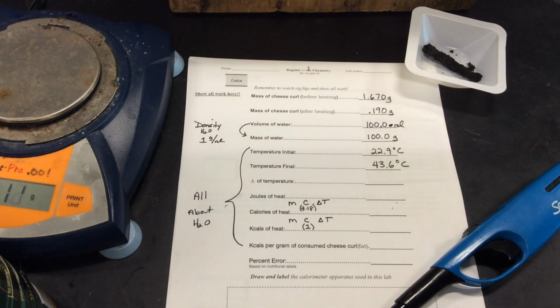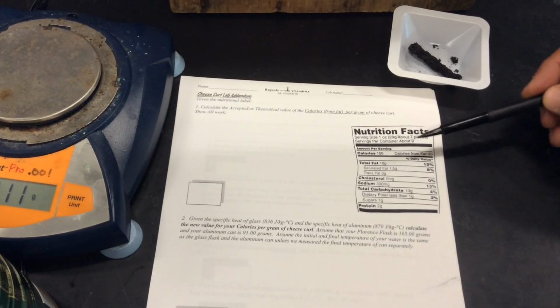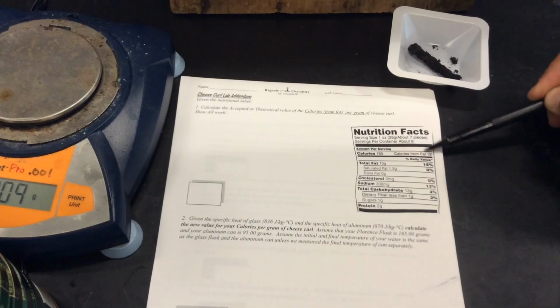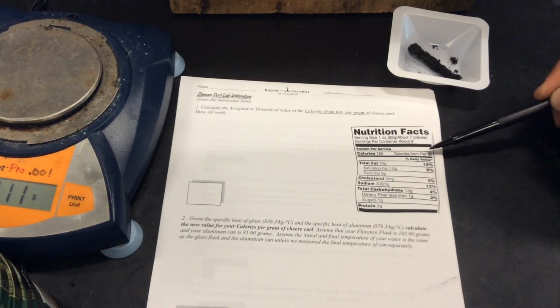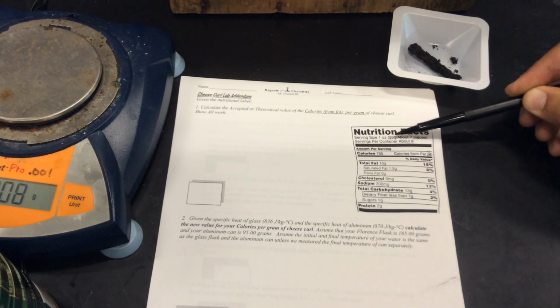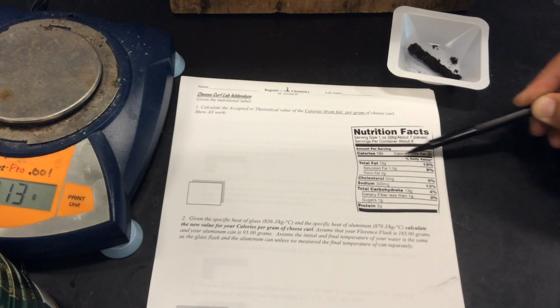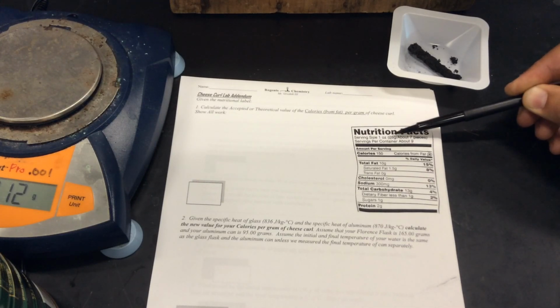So let's go to that quickly. Here's our nutritional label. Notice they're going to give you the calories from fat are 90. Notice they're giving you 28 grams in their serving. So what good is calories if you don't know per serving, even though I'm writing on it? So this is 90 and this is per 28. So we're doing kcals per gram. Per means divide by. So I take this calorie, which is really a kilocalorie, right? So 90 kilocalories divide by 28.